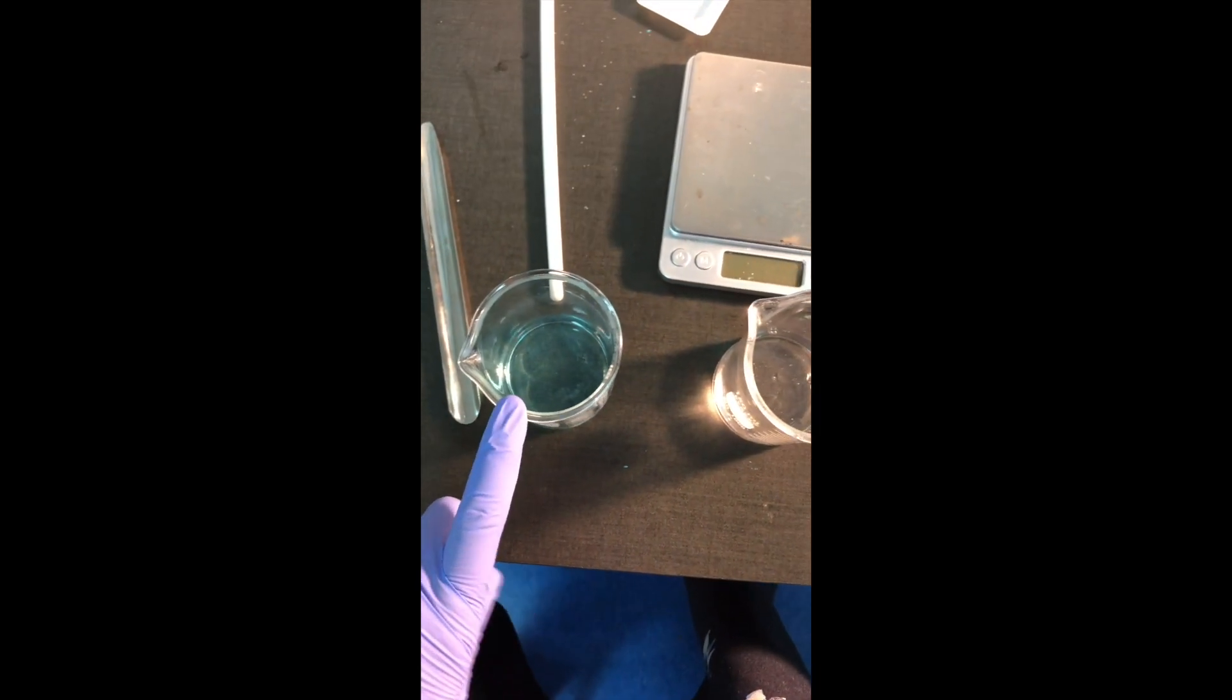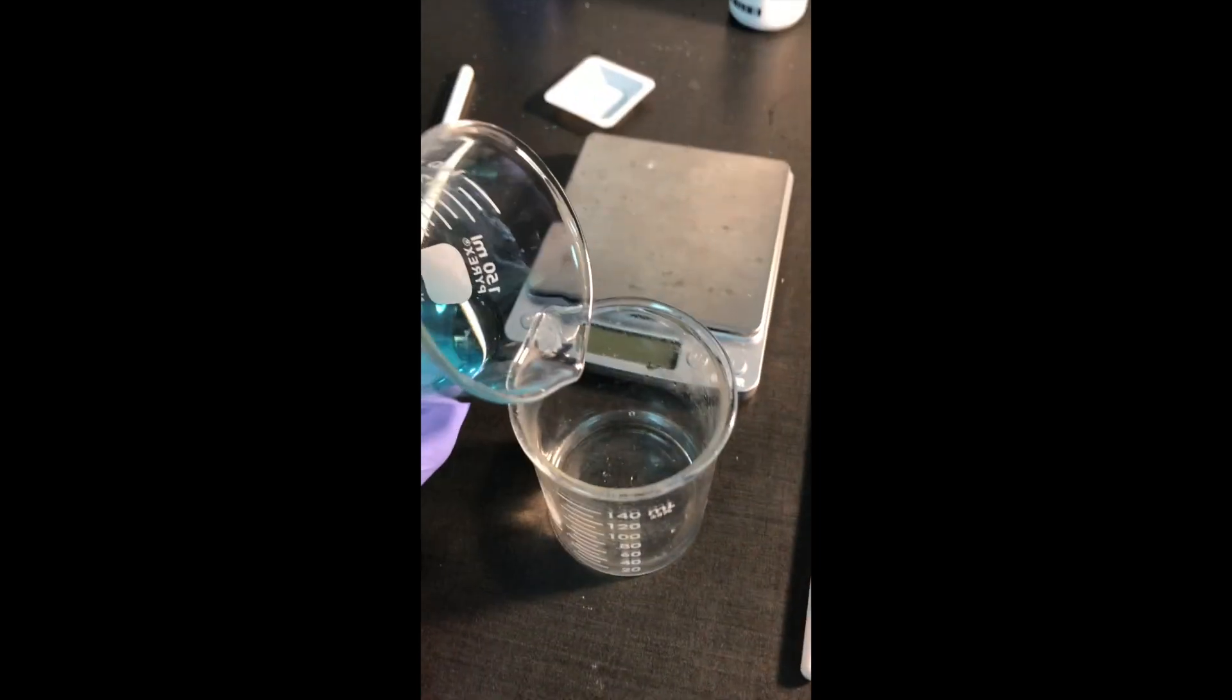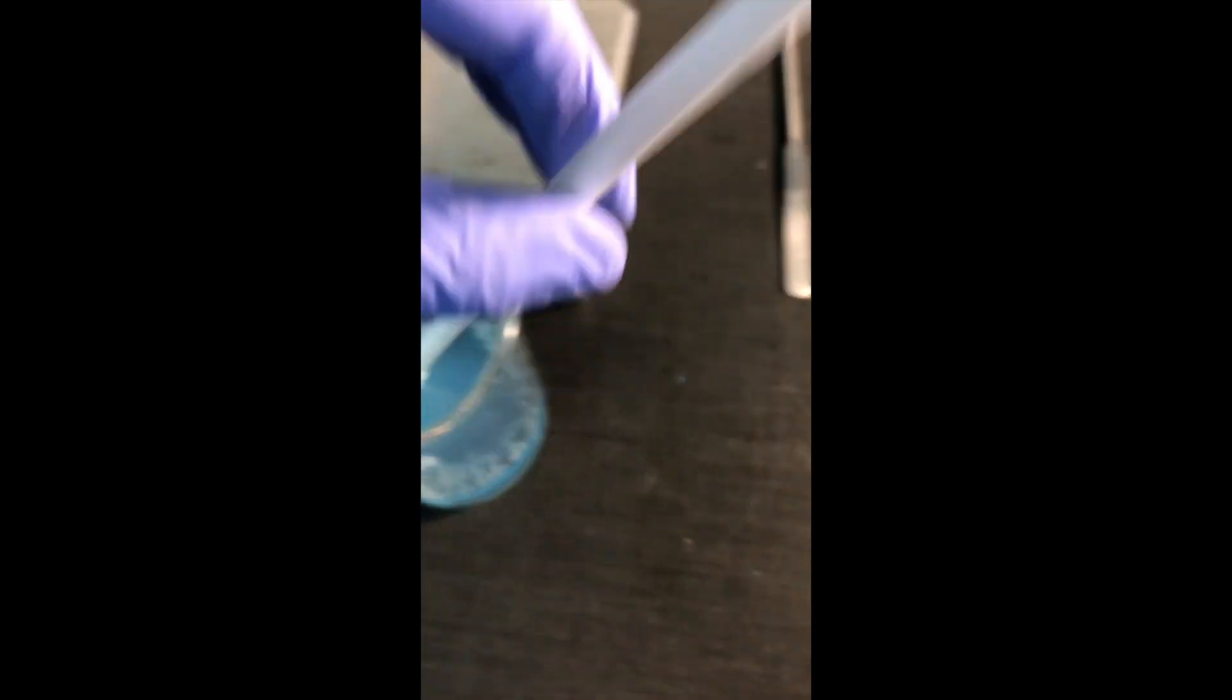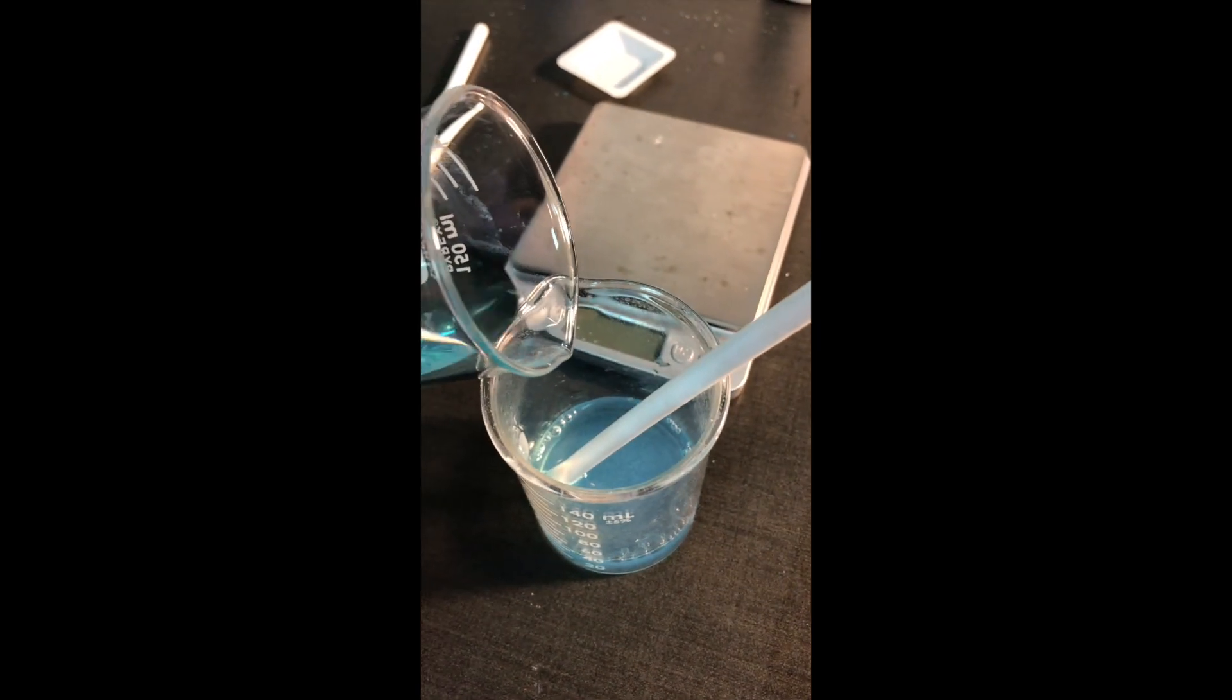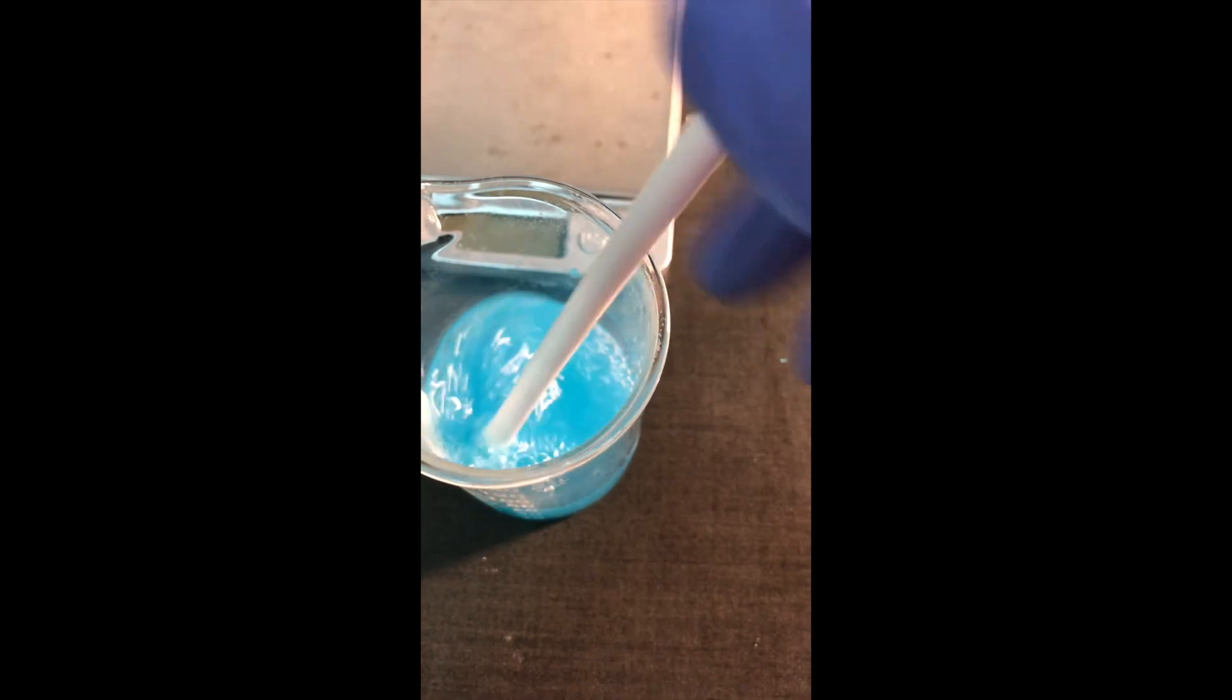I have the copper sulfate solution and the sodium carbonate solution. I'm about to do part two of the procedure, which is the actual reaction. So we're going to slowly pour this in. And we immediately see the reaction. This is what you should see if you've done it correctly. You should see the solid copper carbonate precipitating out of solution. Now I'm going to stir this just to make sure it's fully reacting. Let's pour in some more of the copper sulfate solution. And pour in your last bit of copper sulfate solution.